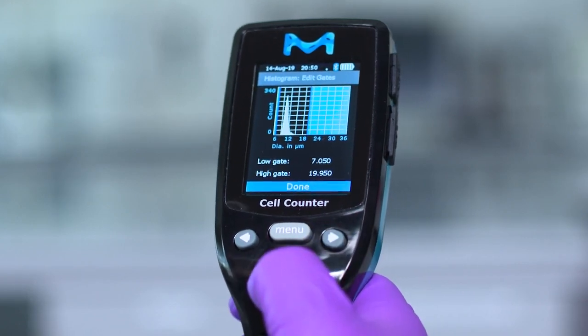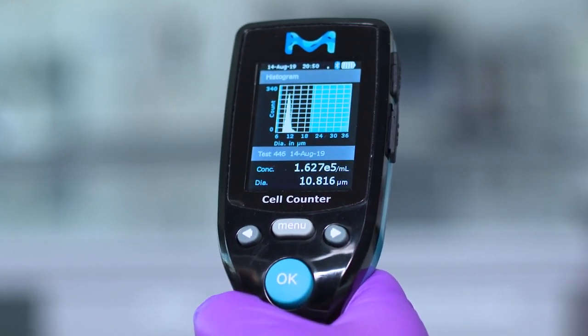Move selector to done and press OK to return to see the newly gated histogram. The new generated concentration and diameter values are shown.